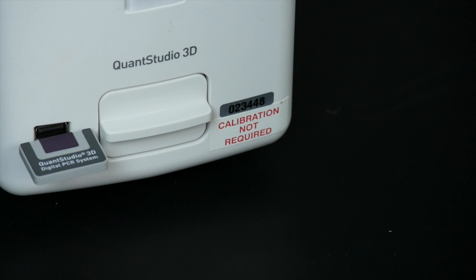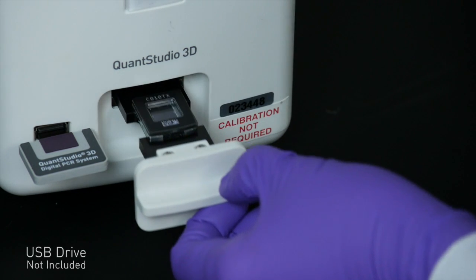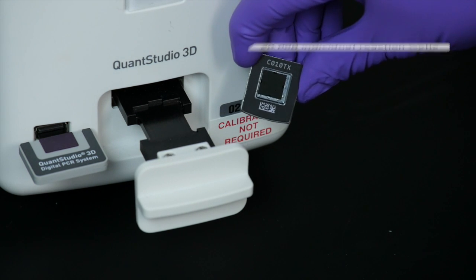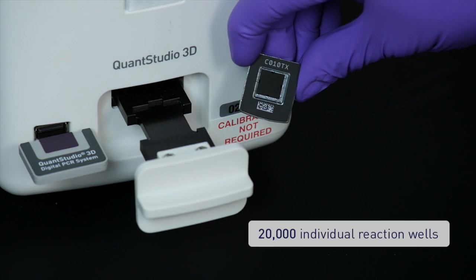Digital PCR on the QuantStudio 3D Digital PCR system employs a simple workflow with minimal hands-on time. At the heart of the system is a silicon chip, which consists of 20,000 individual reaction wells.